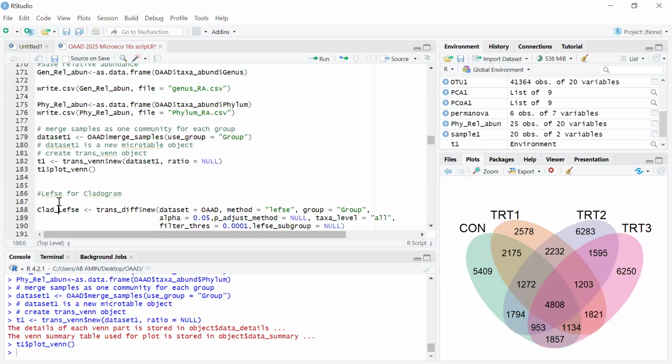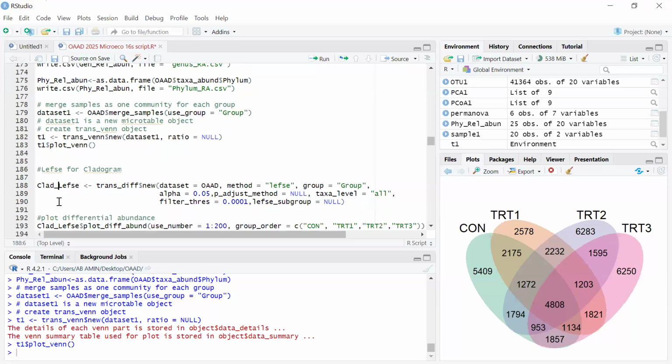Yeah, but maybe you can just quickly come again on the question. She saw that there's a difference in her PCoA and PCA. So please, she wants to know what is exactly the difference. That's the question.